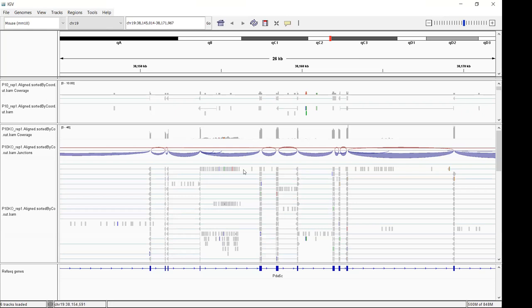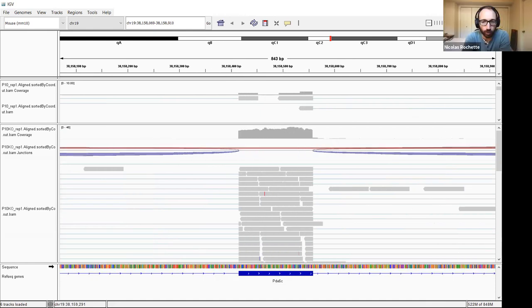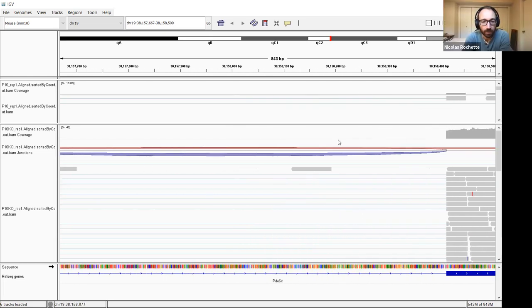Can I ask, what's the significance of each of these rows? Why are some reads gathered? So if you zoom in on one, let's say on the two exons, the blue lines actually connect things that are the same read. So they're the splicing events within the reads. But then what puts two reads in the same row, adjacent, without a line? Exactly, without a blue line.